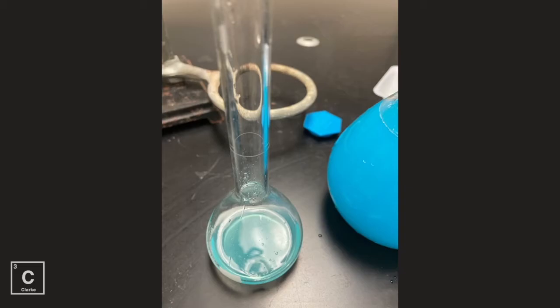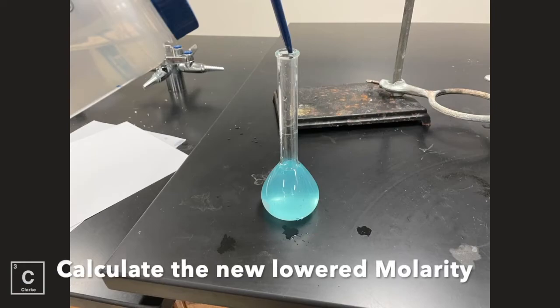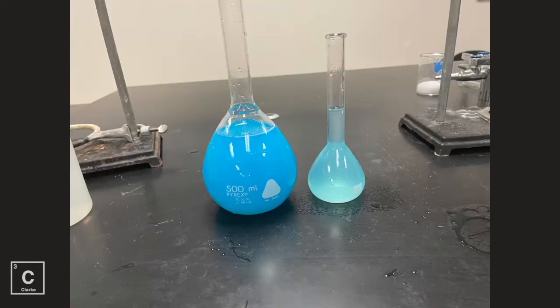Now for this dilution I'm using a 100 milliliter volumetric flask. And here we are, a final comparison. We've got our stock solution which is missing a little bit of a portion because I used it to make our diluted solution. So we would say the stock solution was concentrated and the new solution is dilute.